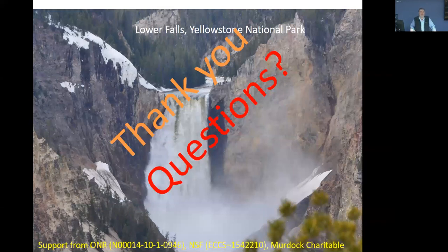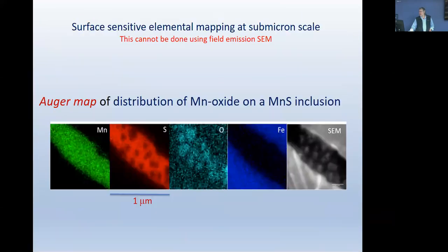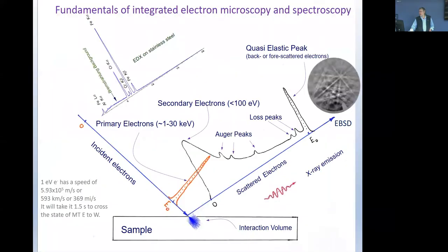Recep, I'm interested in understanding how you generate diffraction patterns. Excellent question. The question is how we generate these Kikuchi diffraction patterns. I don't know where I have it, but I have it here. These are the Kikuchi patterns here, and then you take pictures and make sense out of them.